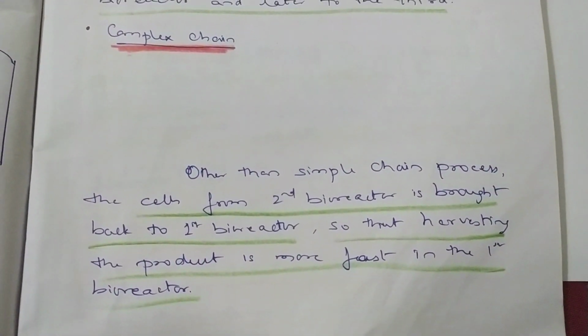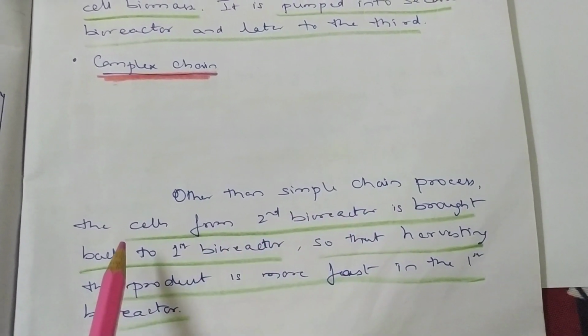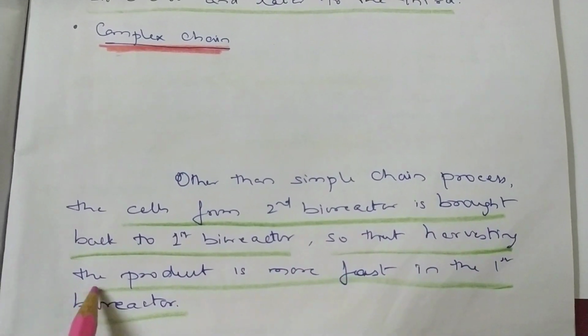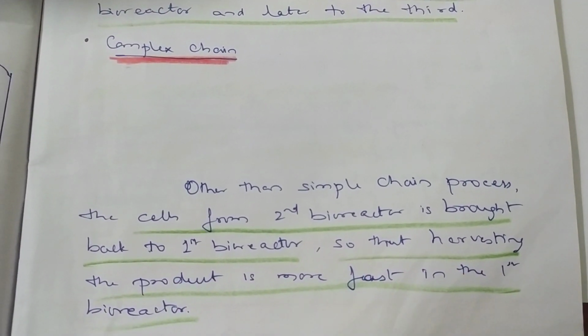Complex chain means you have a bioreactor. I'll read it out first for you. The cells from the second bioreactor are brought back to the first bioreactor so that harvesting the product is faster in the first bioreactor.